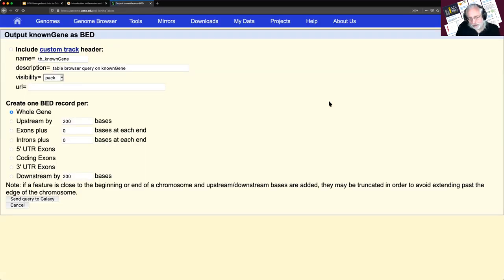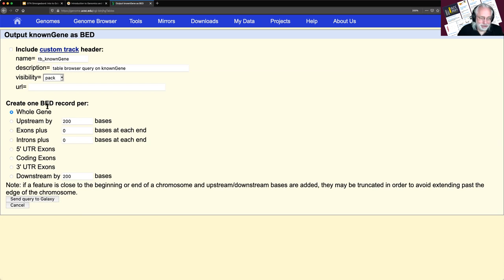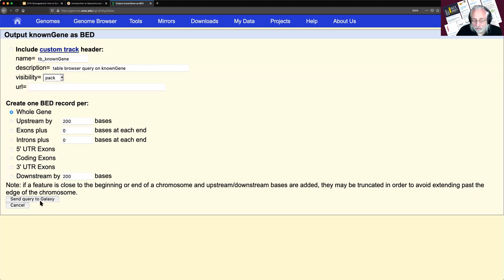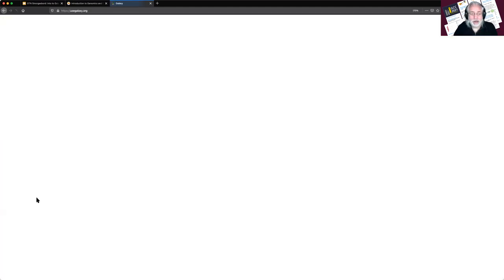It doesn't give us the output directly — instead it takes us to another form. I ignore the custom track option and come down to 'create one BED record per: Whole Gene.' I'm asking a question about genes, so I go with whole gene. Then it says 'Send query to Galaxy.' I didn't change anything here, so I click Send Query to Galaxy, and now it's actually going to send the data.